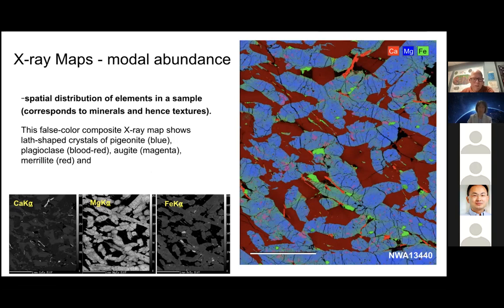This technique is a way that we can measure the abundance of different mineral species within a given area and hence estimate the volumetric abundance. If we correlate the chemical compositions that we measure with an electron microprobe with the abundance of the minerals within them, we can get a measurement termed bulk composition, that talks about how much of each element each mineral within the rock contributes to the overall chemical composition.